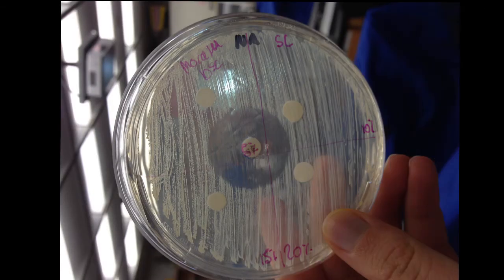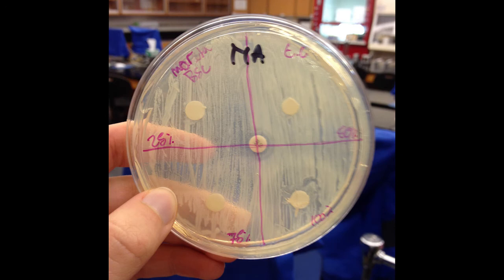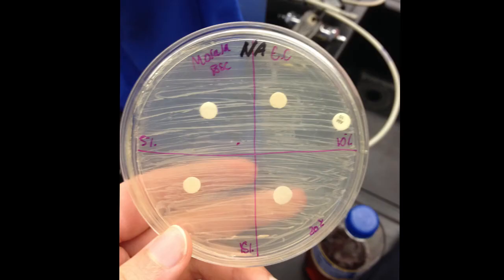The bacteria were not inhibited because we hypothesized that since all the bacteria were not covered in the nutrient agar, probably it did not have enough water quantity, enough potential to get sucked out of the bacteria, causing it to still live. As we can see, the halo around the bacteria inside this circle could be the killed bacteria, but not completely killed.